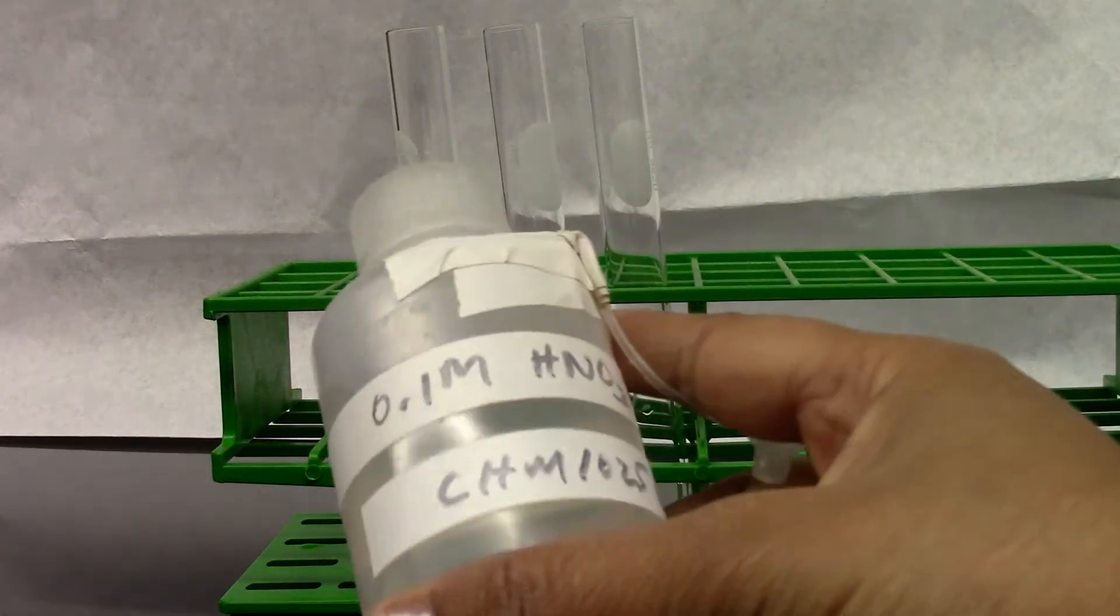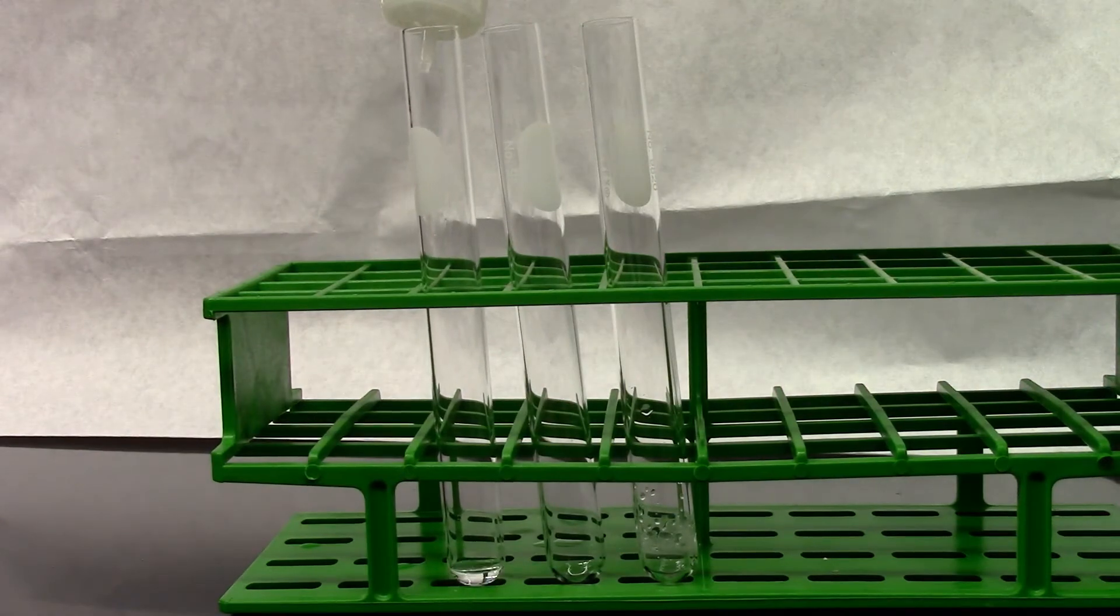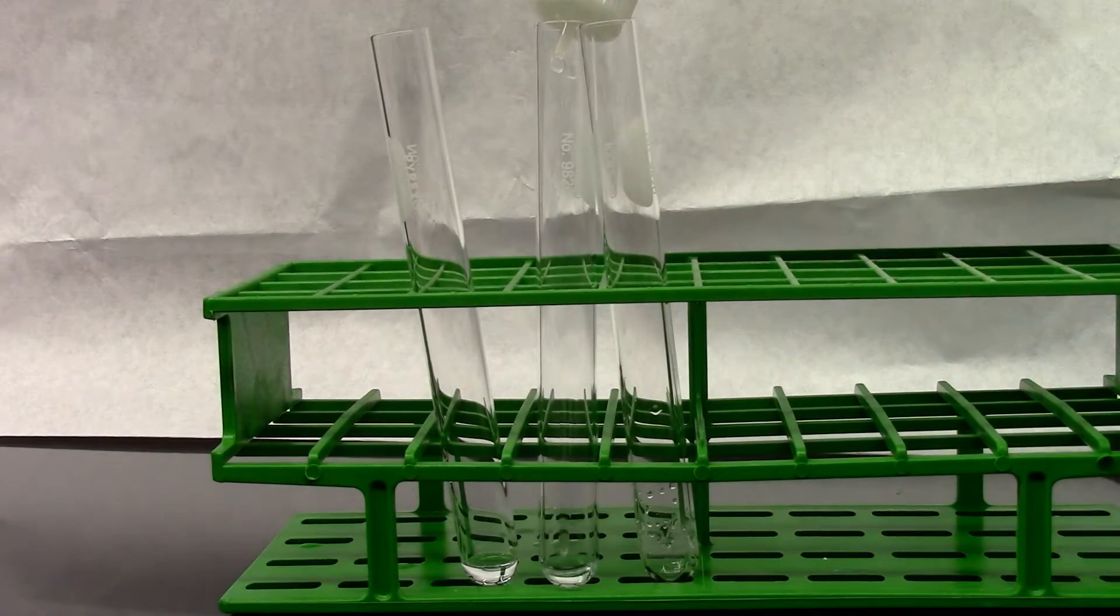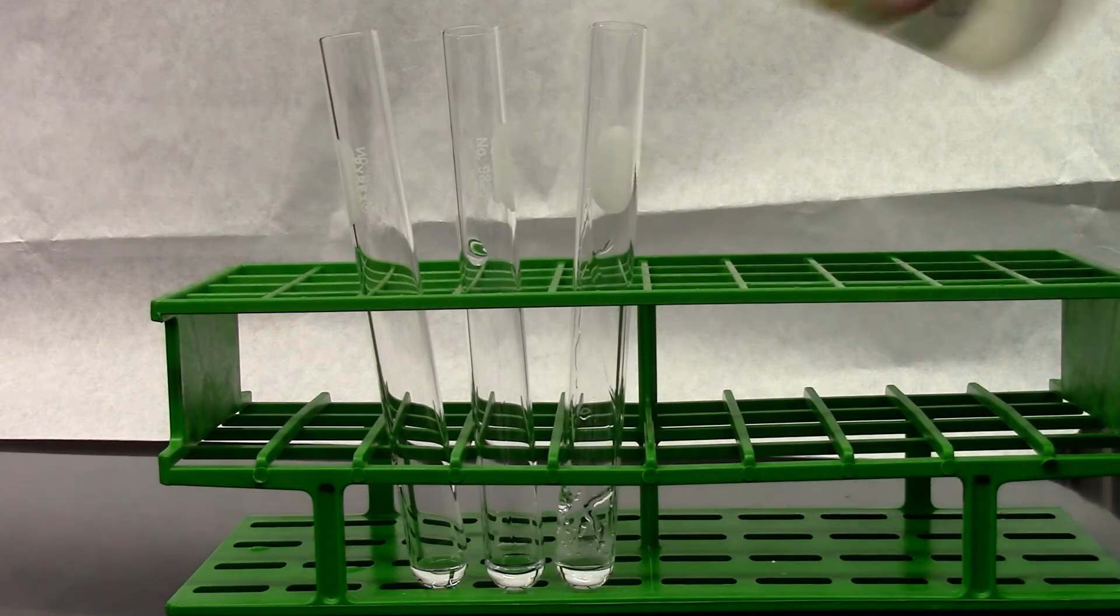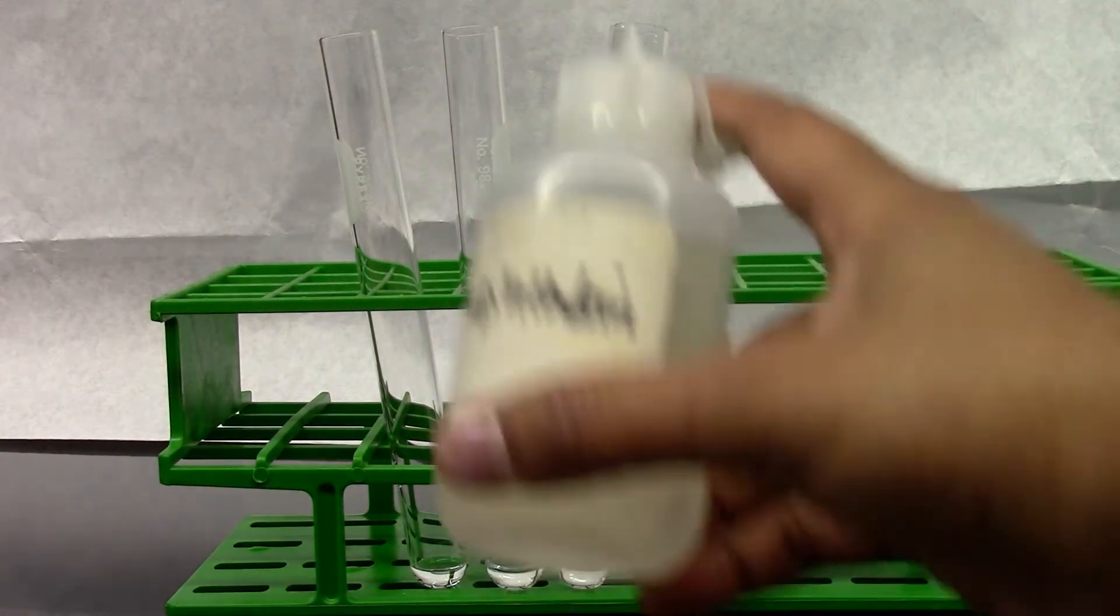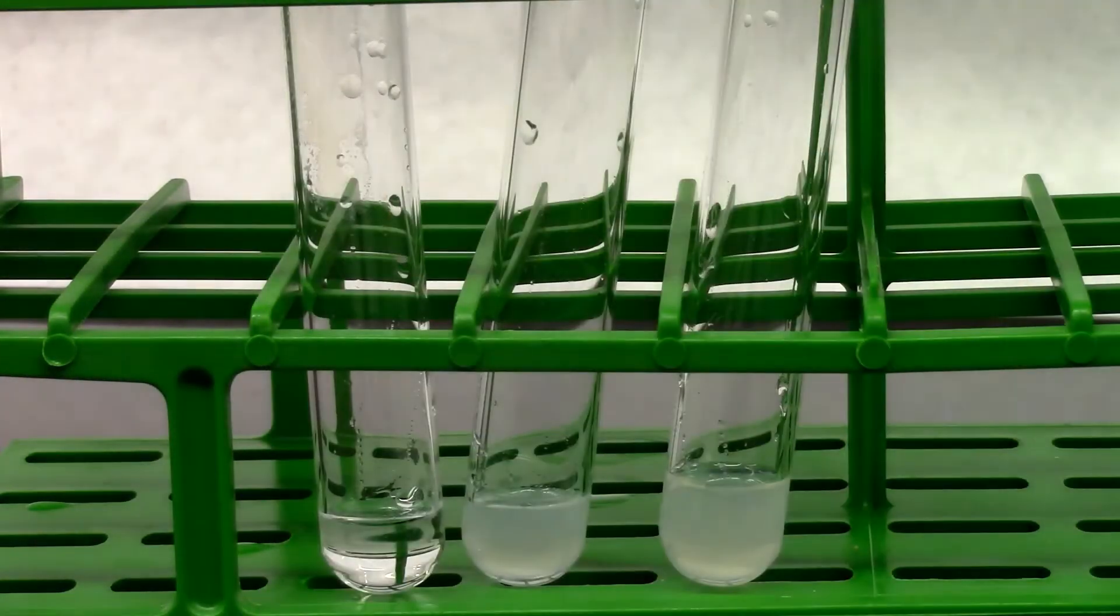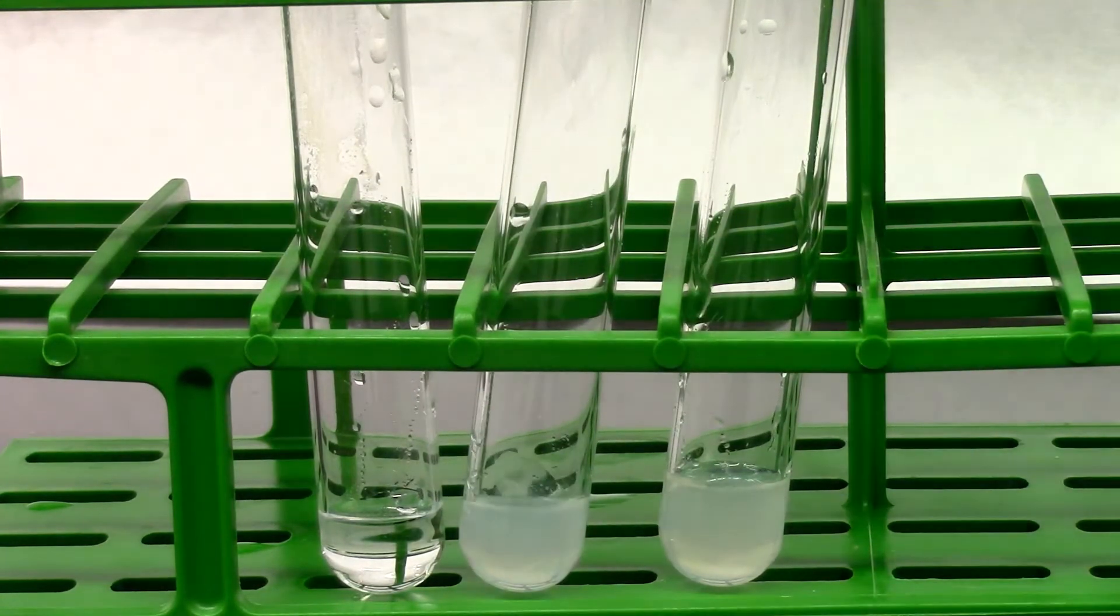At three test tubes I'm going to add 10 drops of nitric acid on the first one. 10 drops of sulfuric acid in the second one. And 10 drops of phosphoric acid in the third one. I'm going to add one drop of phenolphthalein which is an acid based indicator. Now I'm going to add sodium hydroxide drop wise until there's a permanent color change. So it's an acid based neutralization reaction.